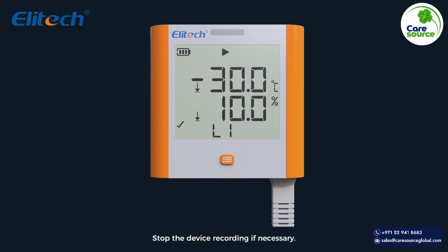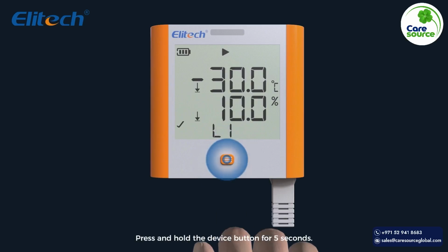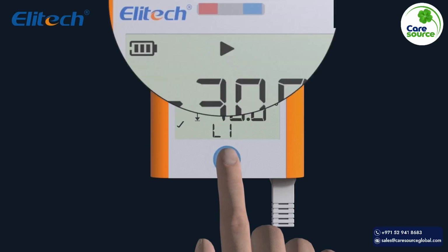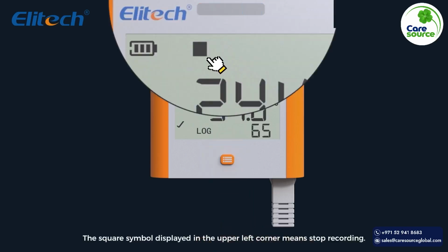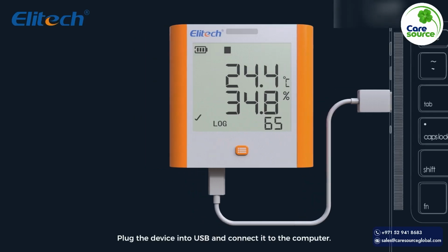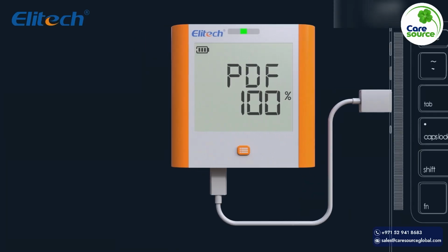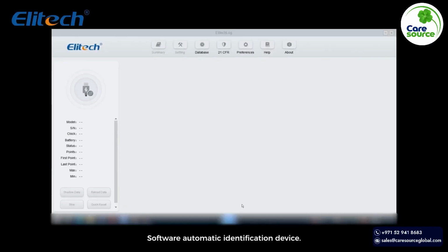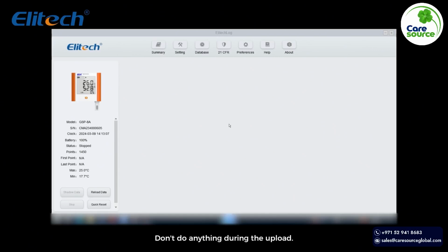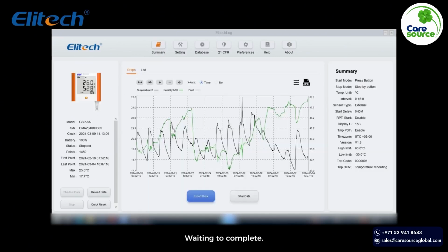Stop the device recording if necessary. Press and hold the device button for 5 seconds. The square symbol displayed in the upper left corner means recording has stopped. Plug the device into USB and connect it to the computer. The software automatically identifies the device and uploads data into the software. Don't do anything during the upload. Wait for it to complete. If not uploaded successfully, click the Reload Data button on the left to upload again.